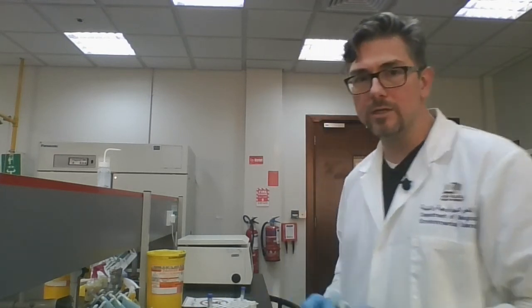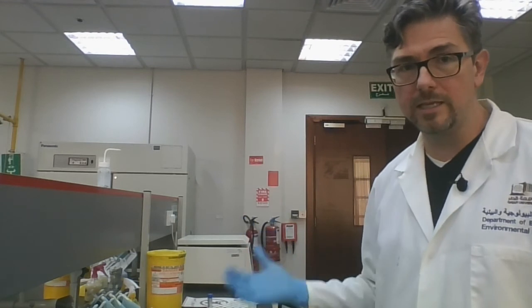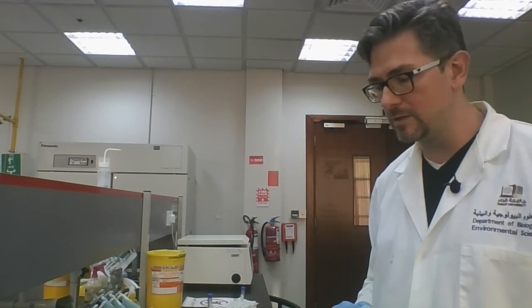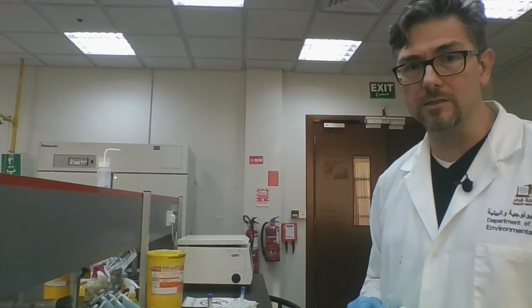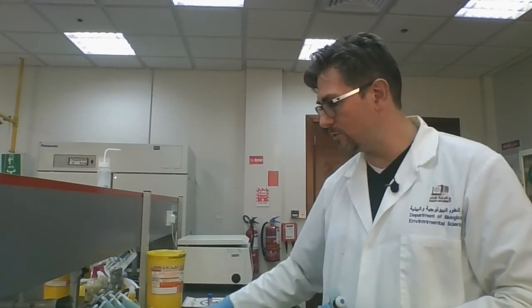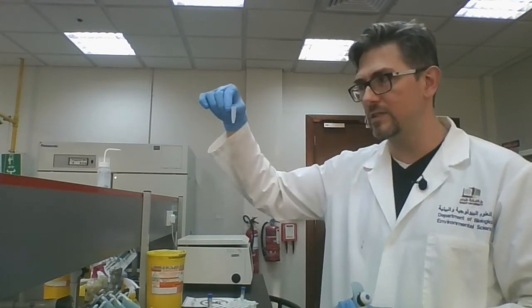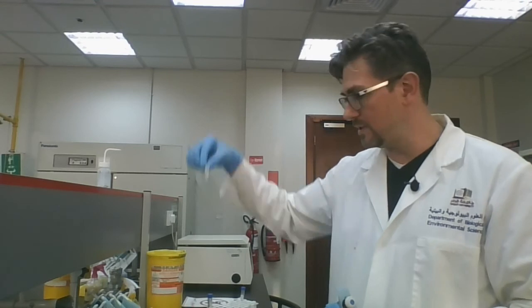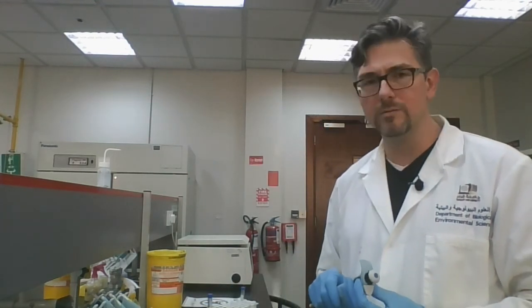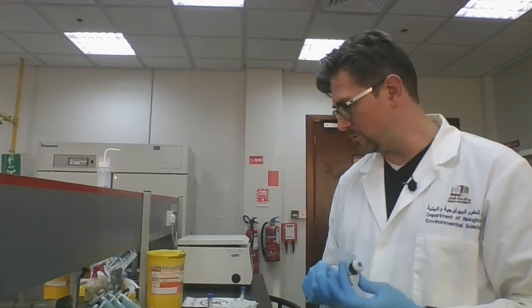350 microliters of the aqueous phase that contains DNA and RNA, and if there's any protein left, there's very little at this point, so we're going to be precipitating our DNA and RNA. We do that by adding ethanol, okay? We're adding two volumes of ethanol, so twice as much as what you put in. So it's useful to know the volume that you have in here, that's 350, so that I know how much more ethanol I need to add. And so I need to add about 700 microliters of ethanol. So that's what I will do right now.